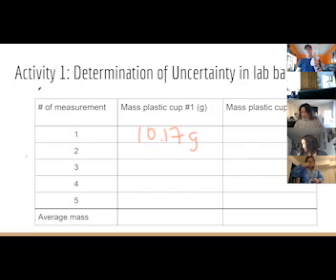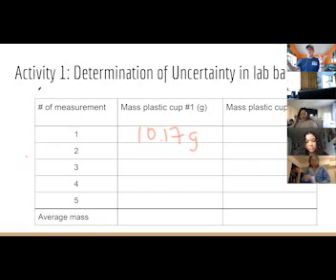So like I said, these are not precision instruments. It's just a cup, right? You probably would see less tolerance in something like these, or like a more scientific instrument. These are not scientific instruments, it's just a damn cup. So one thing I want to point out about the table, notice that it has the units in there. That is essential.